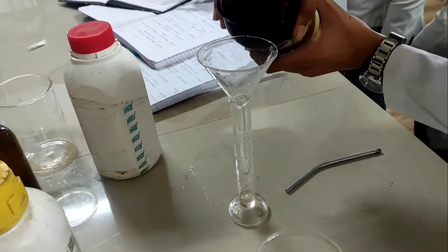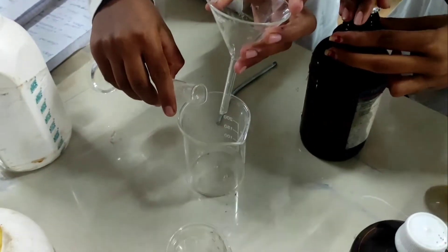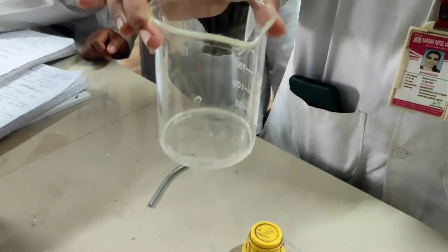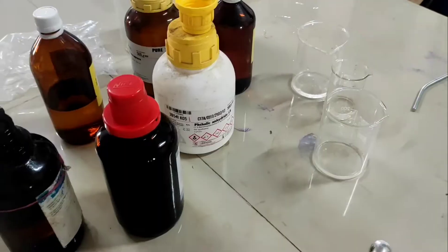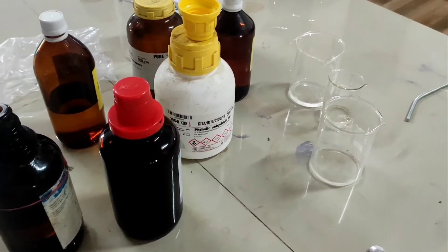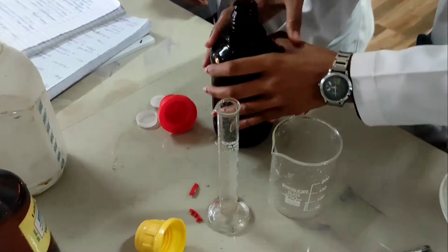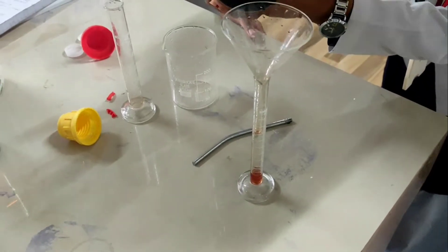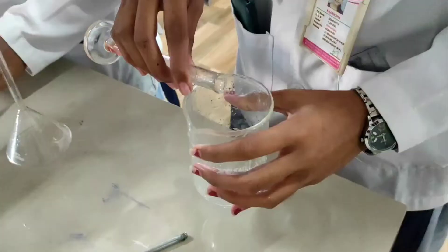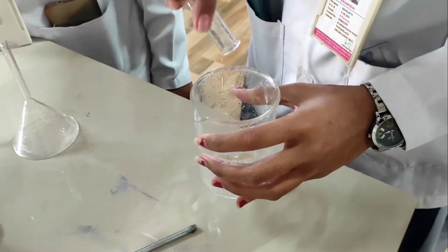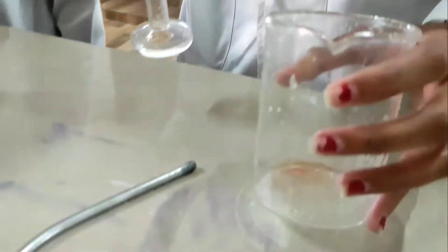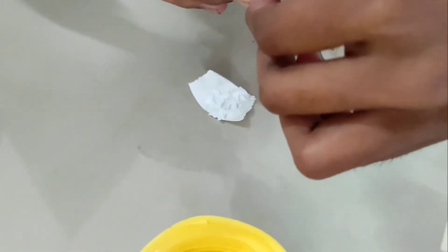If you talk about other chemical requirements and glassware requirements, you require sodium bicarbonate, potassium permanganate. This mixture can be used as a detecting agent after the separation of components by paper chromatography. You need a spray bottle, a beaker, a glass rod, a petri dish, and Whatman paper, which is used as a stationary phase in paper chromatography. Why is Whatman paper used? Because Whatman filter paper is good in quality and the movement of the solvent is uniform throughout the paper.